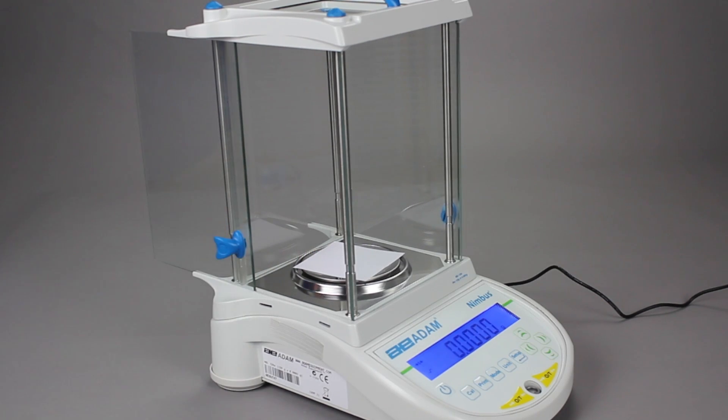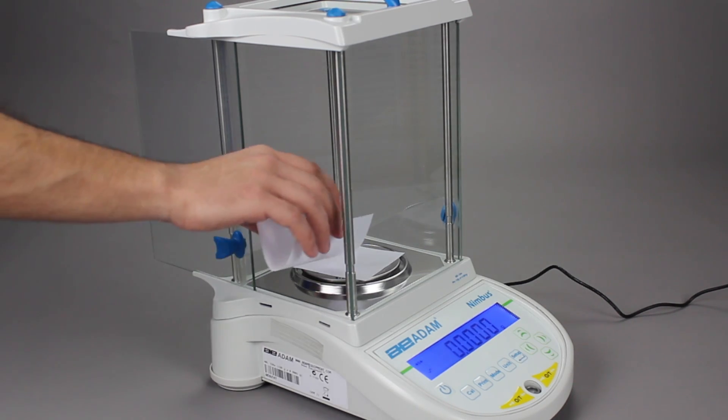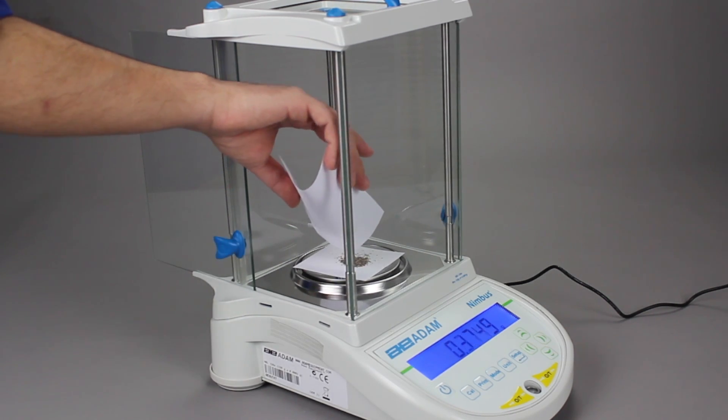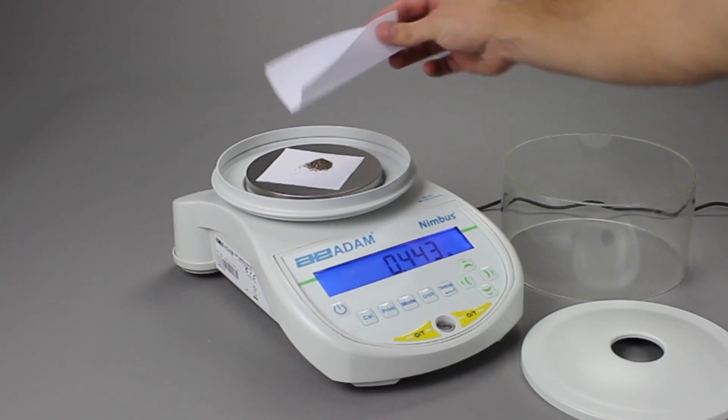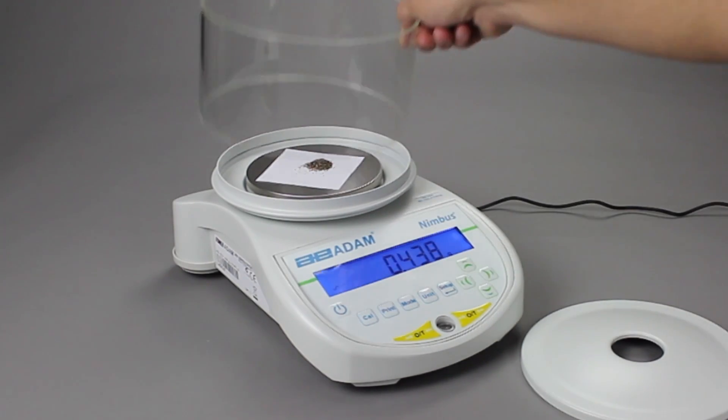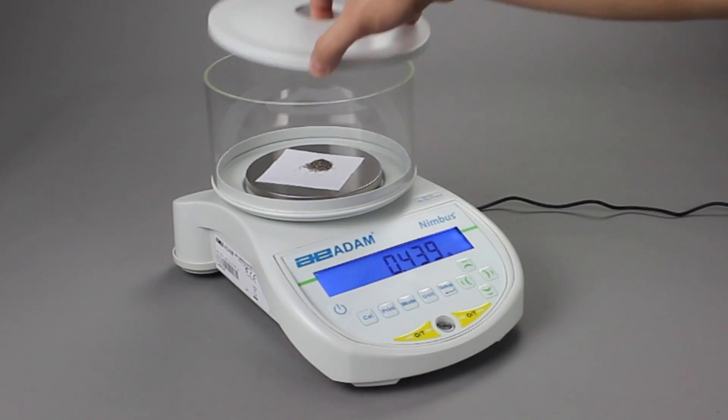To reduce errors from air movement, Nimbus analytical balances are equipped with a glass-enclosed weighing chamber that can be disassembled for cleaning. Models with one milligram readability come with a removable round glass shield.